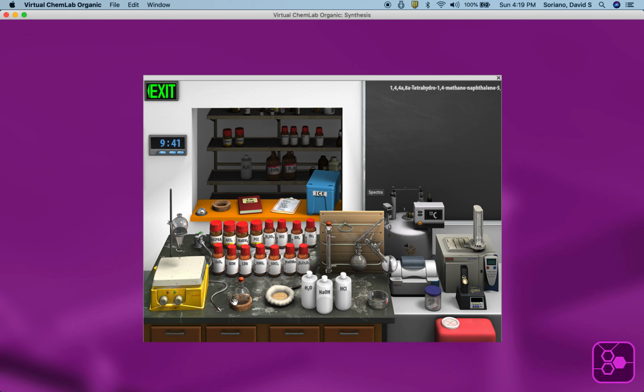If you have simply a product in, let's say, diethyl ether, when you move the round bottom into the sep funnel, wash it, you take your top layer, bring it down, the ether will presumably be rotovapped off, not shown, leaving you with the solid product. In the last video, I attempted to heat it, and there's no point in doing that because it's going to be a solid product. So anyway, that'll give you an idea of the types of things you can do.